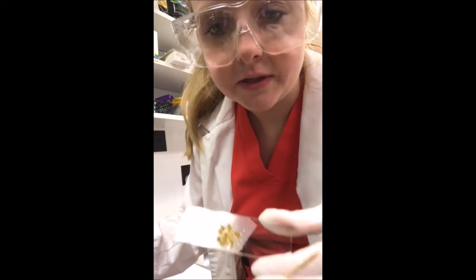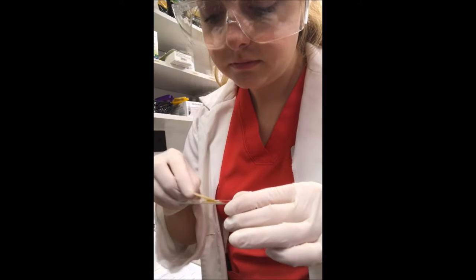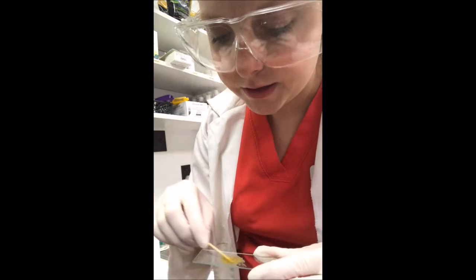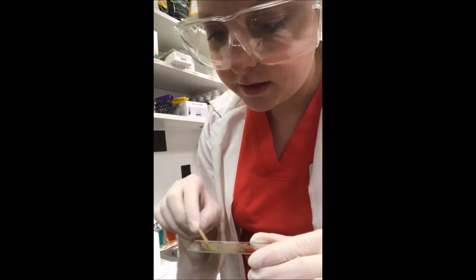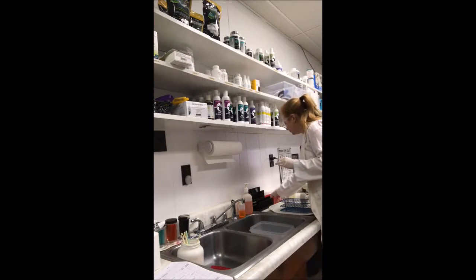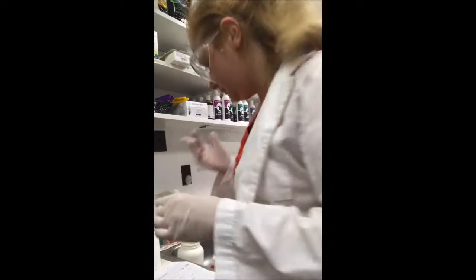So this isn't thin enough, so I'm actually going to add a little bit more saline to this. So that's much better. Make a really thin layer, and then I'm going to get a cover slip. I'm going to place a cover slip on the slide.